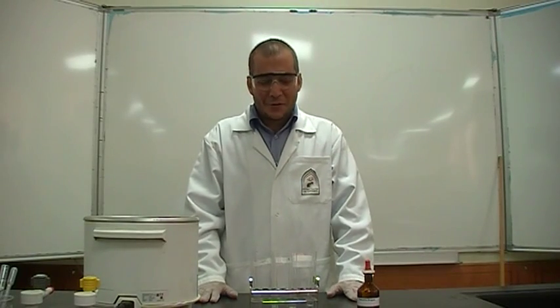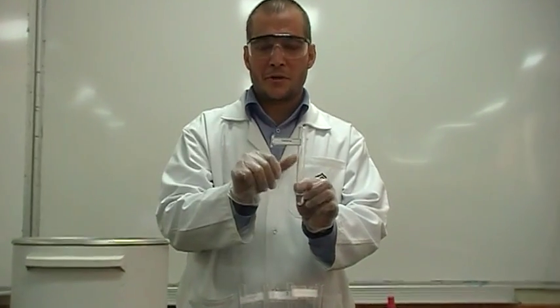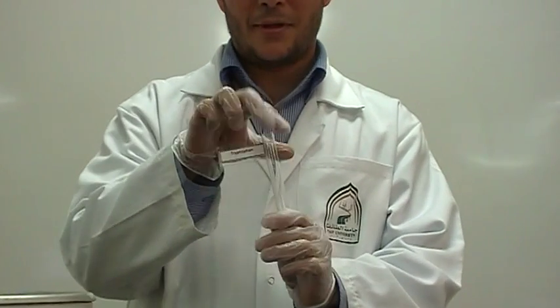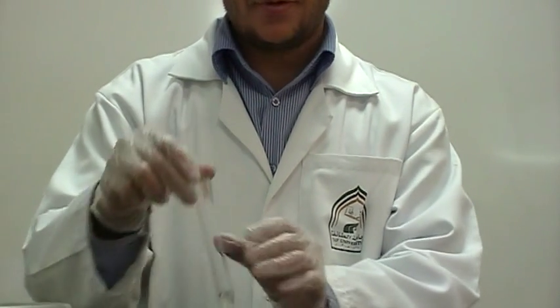So let's do the main ninhydrin experiments. I brought you two amino acids: glycine and tryptophan, and two proteins: albumin and peptone.